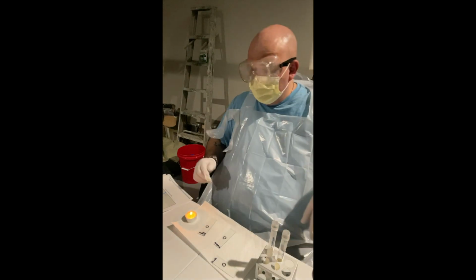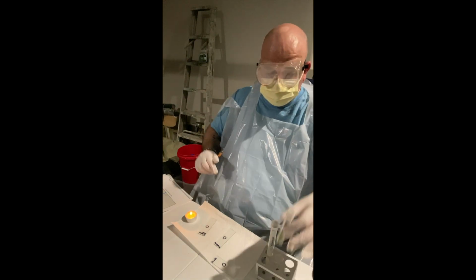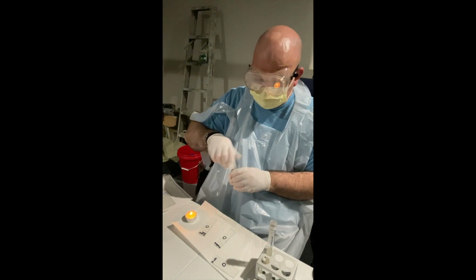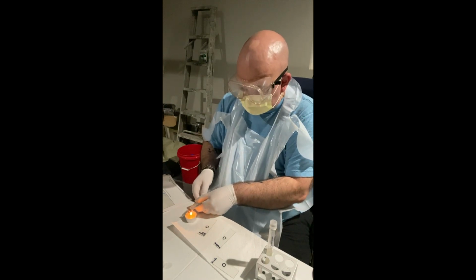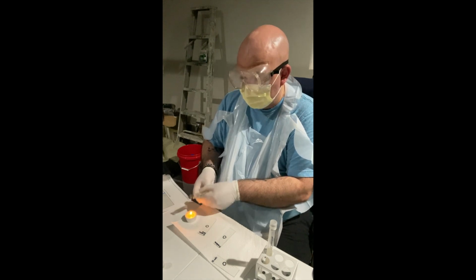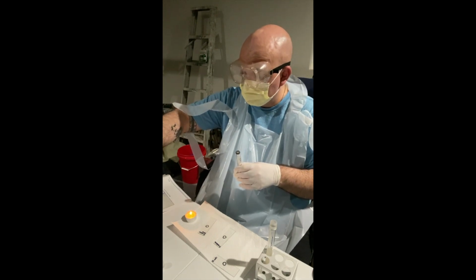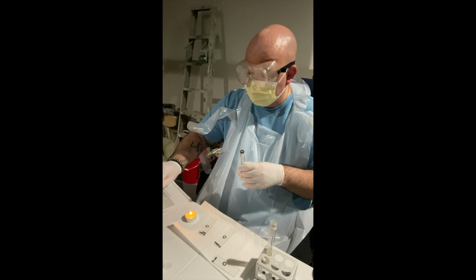Okay. So next, again, I'm going to do the same thing for my S. epidermis. So this is my S. epidermis tube. And interestingly enough, now that these tubes have, I guess, been incubating, if you will, for a while, although I don't know if incubation can happen in a cold fridge, so far the E. coli and S. epidermis do have a very distinct odor.